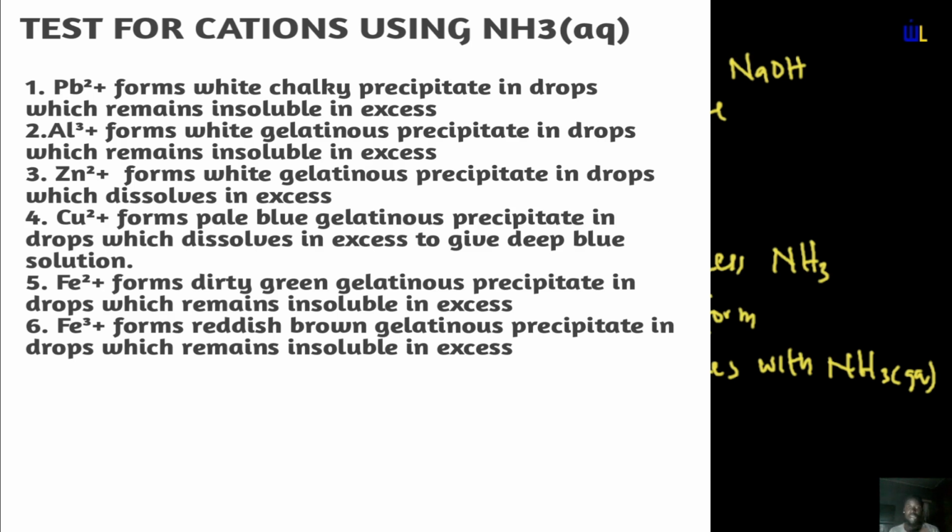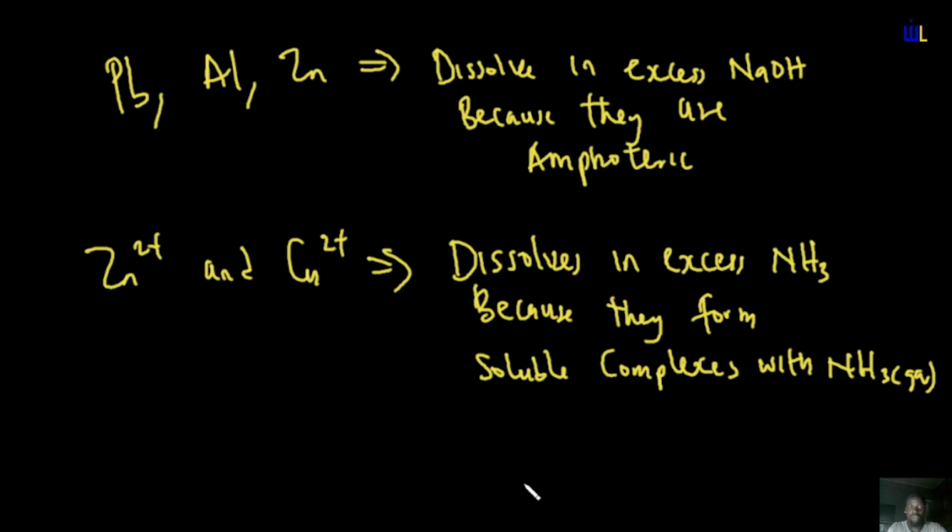So these things are our tests for our cations. Now, mind you, it is important for you to note that anytime you are testing with sodium hydroxide, it is not used for confirmatory tests. I take it again. Sodium hydroxide is not used for confirmatory tests.